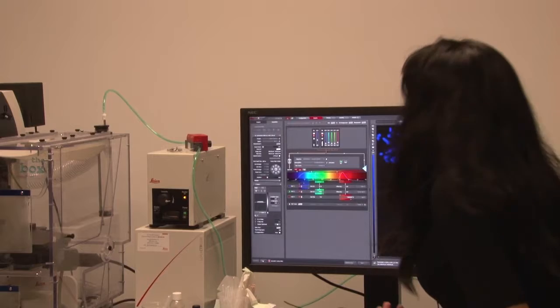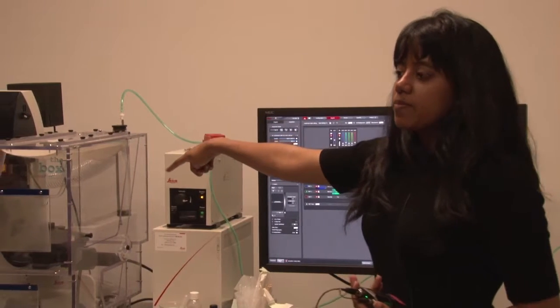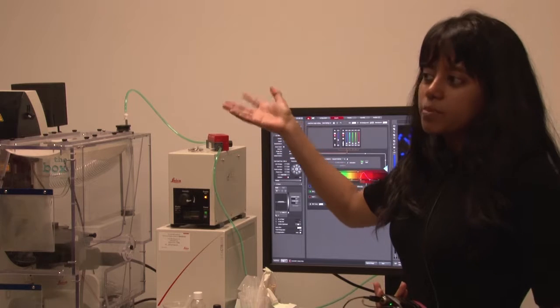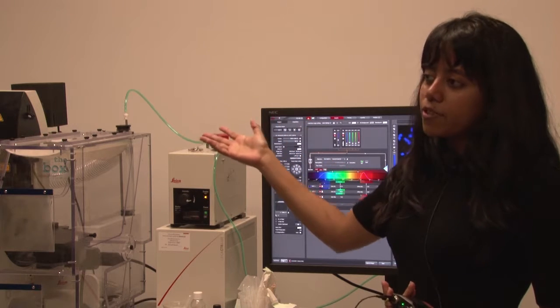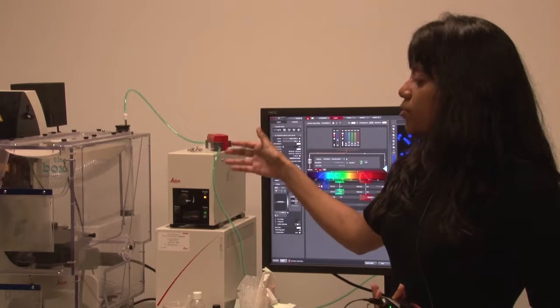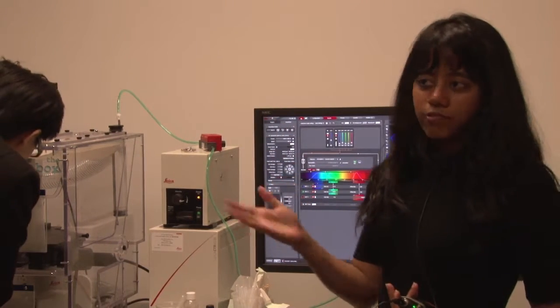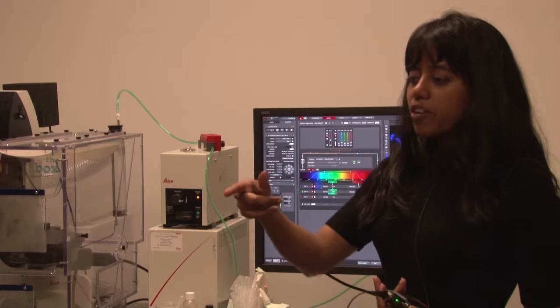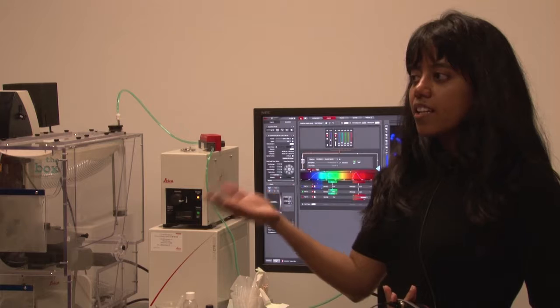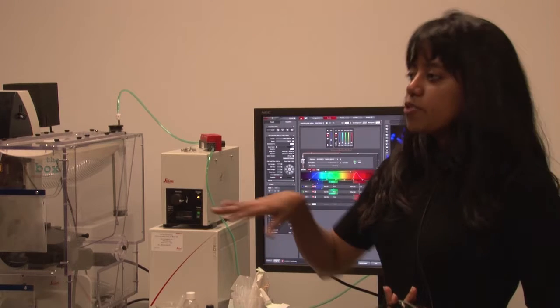Before I go ahead, this one is on a cover slip. The reason I did it on a cover slip was I was doing multiple in situs, like 5 in situs, and then adding DAPI later. So what you would usually do is take normal cover slips. The protocol is there: you coat them with polylysine, dry them, then collect sections on these cover slips and do your in situs.